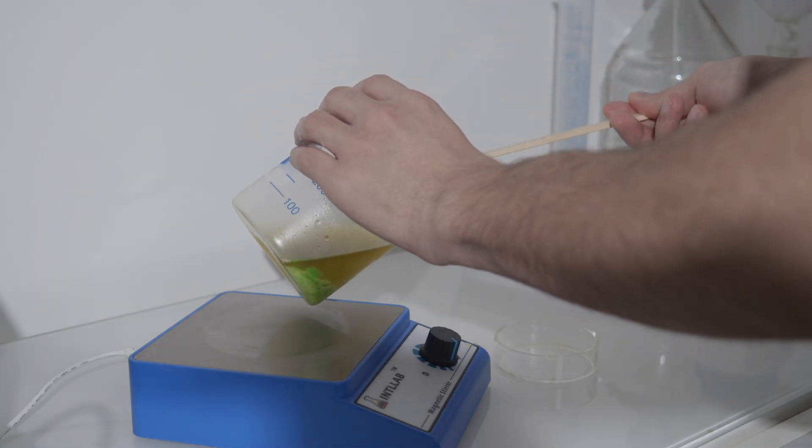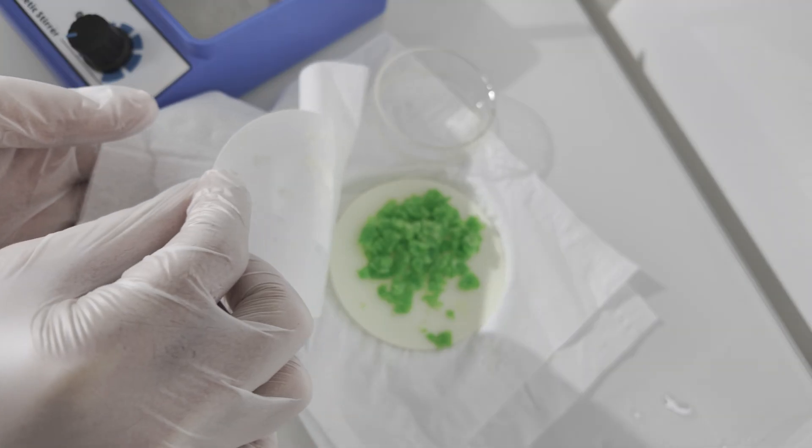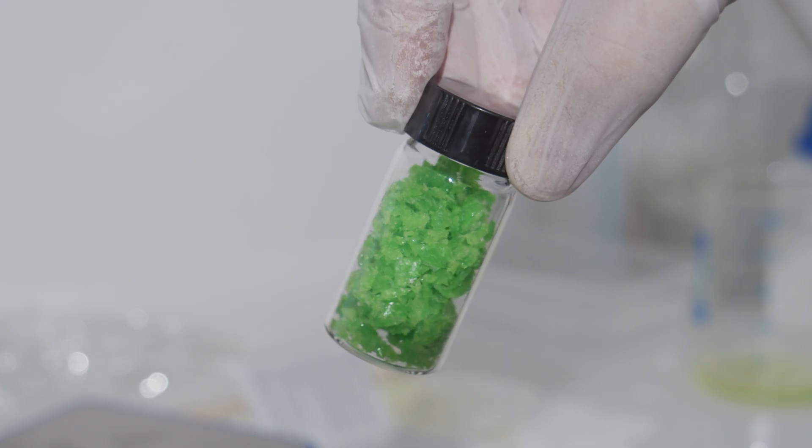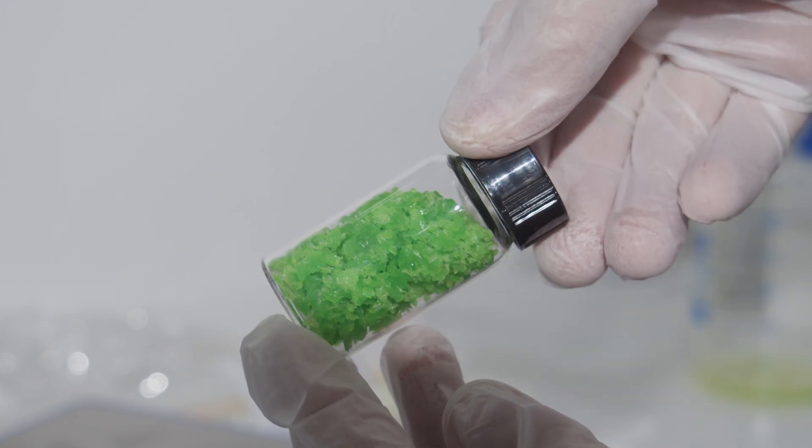And once the crystals had fully formed, I carefully decanted the remaining solution, leaving the crystals behind, then dried them gently using filter paper and transferred them into a vial for storage. The final yield was around 11 grams of pure dark green potassium ferroxalate trihydrate.